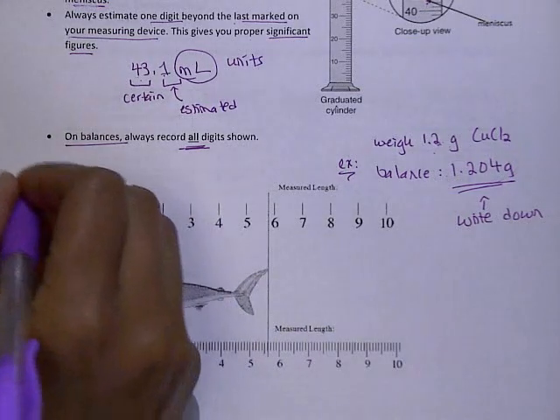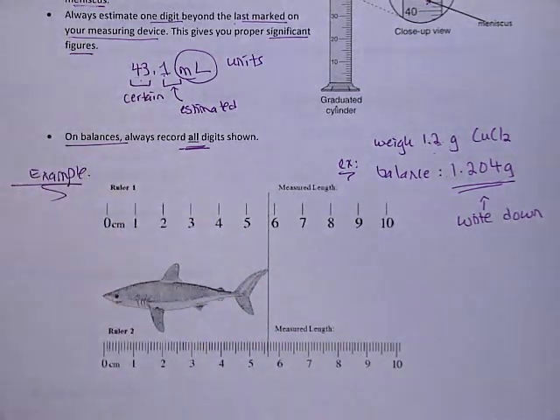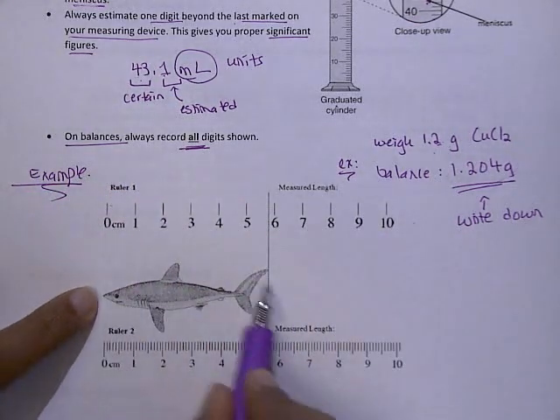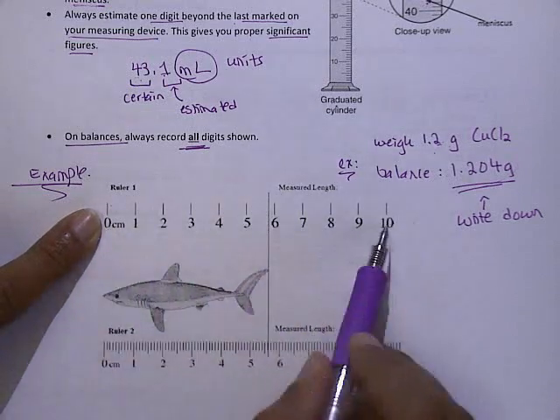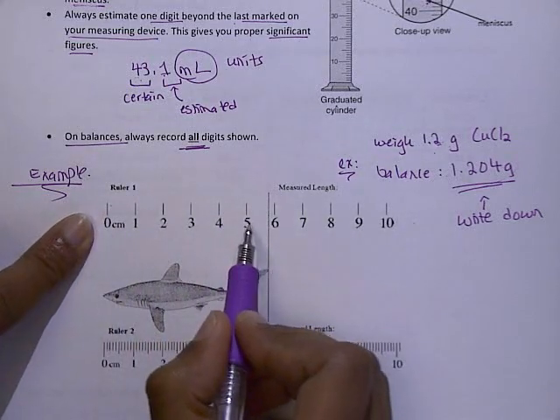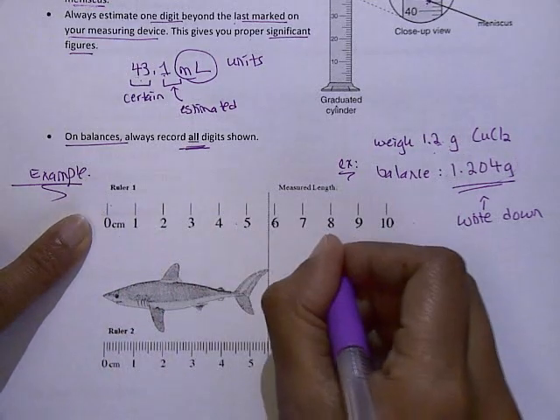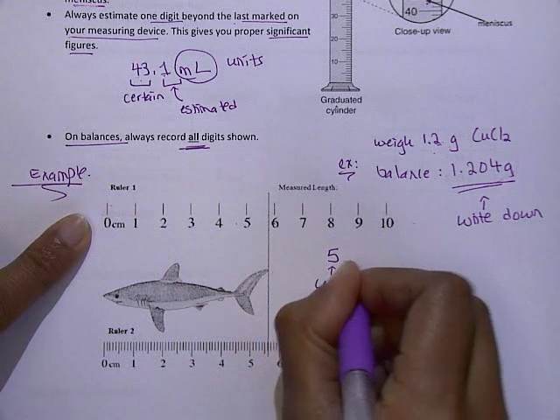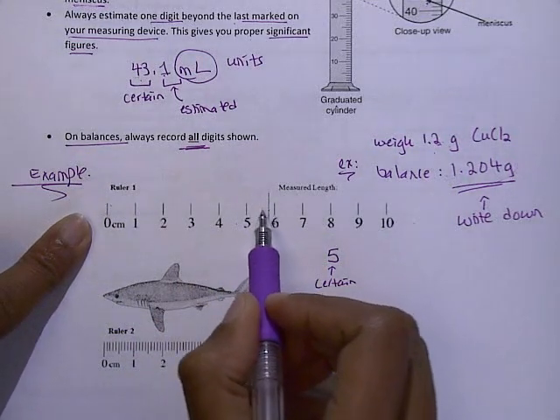Let's go over more examples on how to write down measurements, and how many digits to estimate based on the measuring device that you have. So let's take a look at ruler 1. We're going to measure the length of the shark. So we have increments, 10 increments. Here I'm certain that it's between 5 and 6. So therefore the number that I'm certain of is 5. Certain for ruler 1.